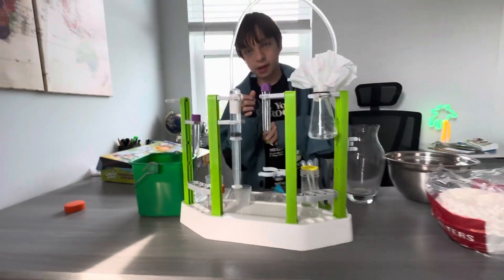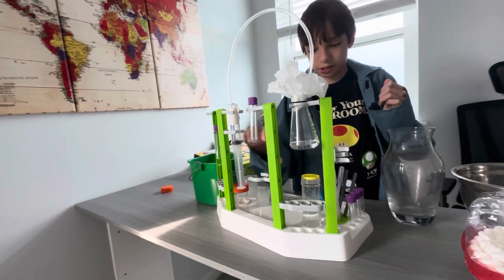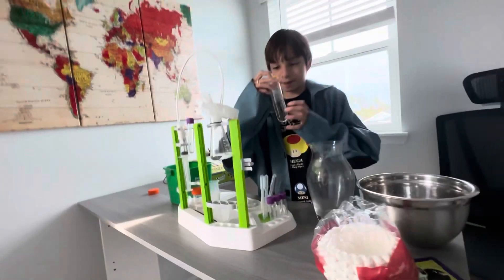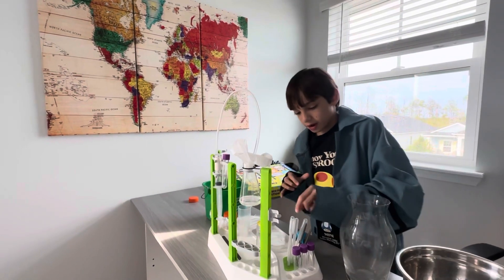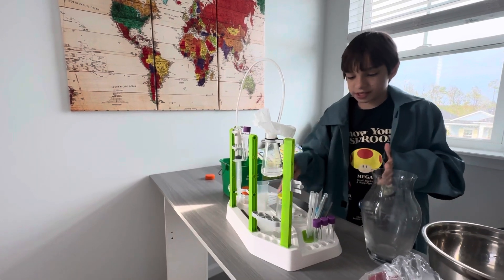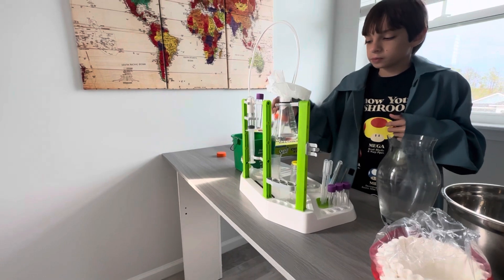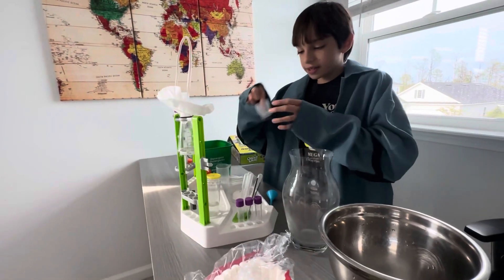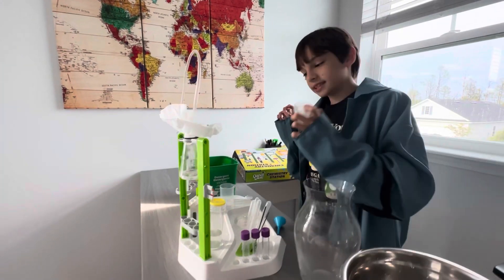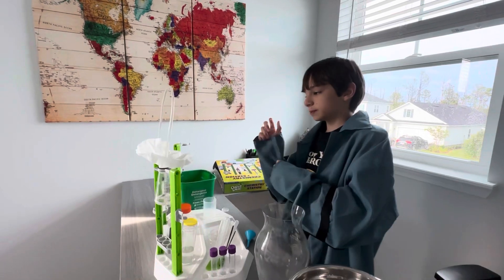First you have the syringe, coffee filters — optional, you can buy them at any supermarket. We have a beaker for collecting, the hose, droppers, mixing sticks, vials, a small shaker, pint glasses — like beer pint glasses — a beaker, and a flask.